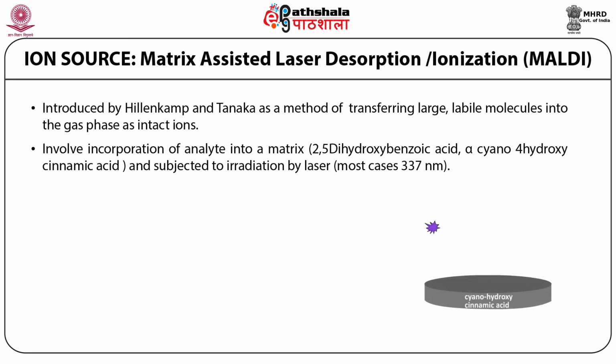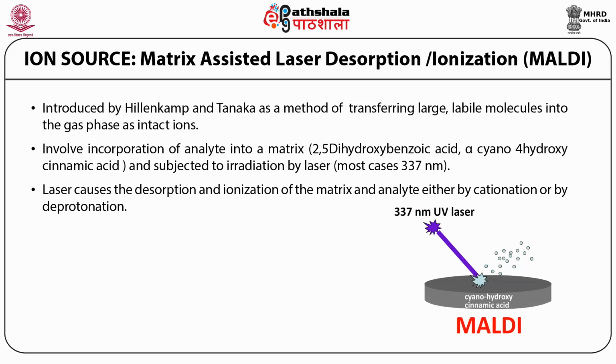Matrix assisted laser desorption ionization, that is MALDI. MALDI is a soft ionization technique where the sample is embedded in a solid matrix, for example 2,5-dihydroxybenzoic acid, which absorbs energy at the laser wavelength of 337 nanometers and transfers a proton to the sample. The laser causes the desorption and ionization of the matrix and analyte, either by cationation or by deprotonation.